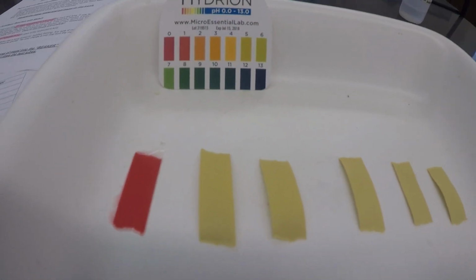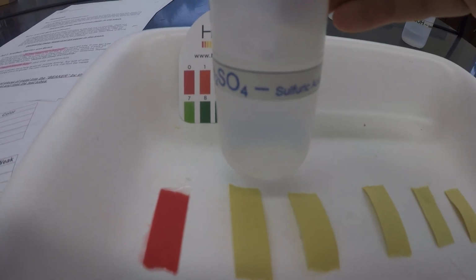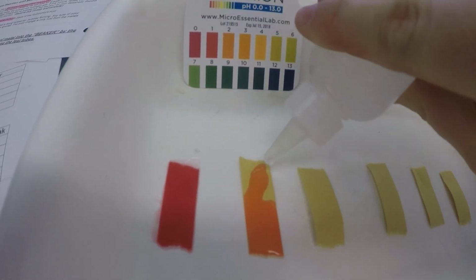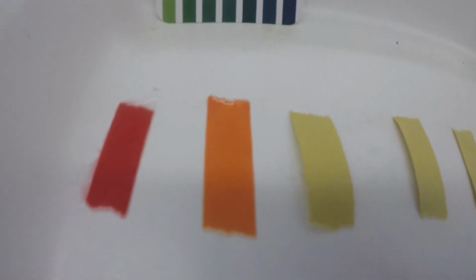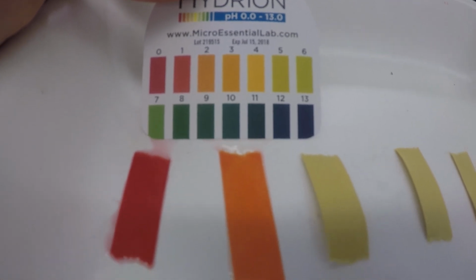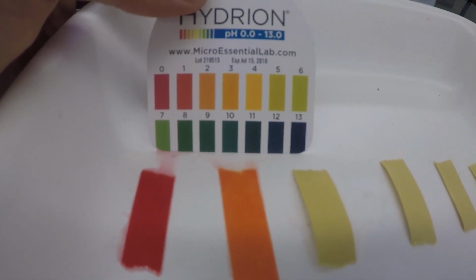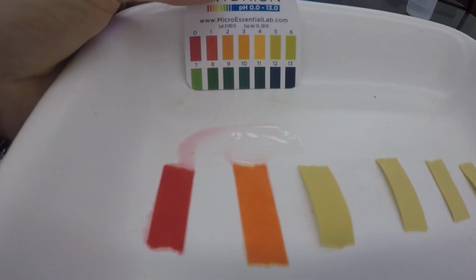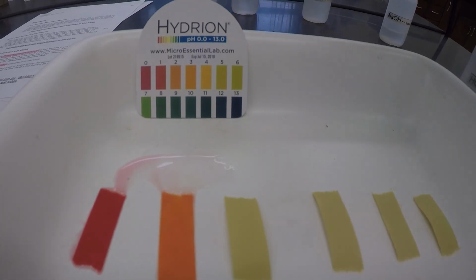Our next one is sulfuric acid. Sulfuric. Now, if some of these are the same, that is okay, not a big deal. What color is this? Based on this color, what pH do you think this is? Okay, acetic.